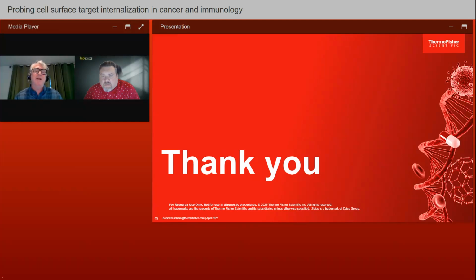The deep red form, of course, you can't use at the same time as the LysoTracker Deep Red. I think that would be about it. It works well with fluorescent proteins and other more traditional imaging considerations, as I showed with the nuclear and membrane dyes. All right, thank you.